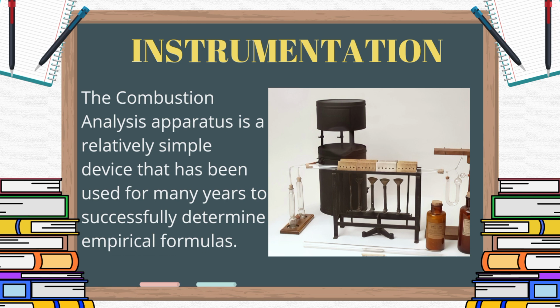Although the instrumentation of combustion analysis has greatly improved, the basic components of the apparatus have not changed much since the late 18th century. The picture displayed on the screen is a combustion apparatus from the 19th century, from the collections in the History of Chemistry Apparatus Museum, University of Cincinnati.